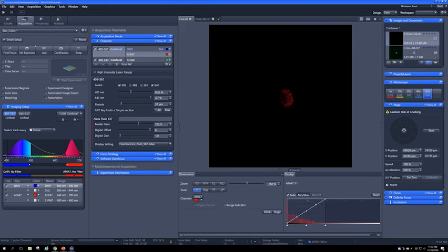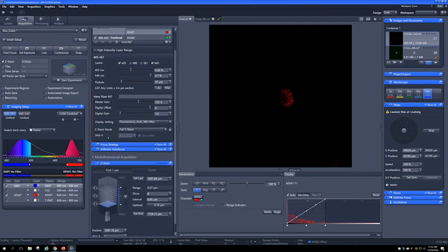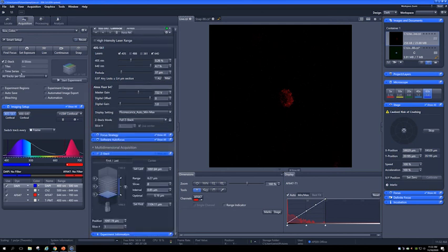To take a Z-Stack, check the Z-Stack box on the top left corner, which will open a Z-Stack tab. While in live mode, scroll to the top of your sample with the focus knob and press Set First. Next, scroll to the other end of your sample and select Set Last. Specify the thickness of slices by either selecting Optimal for the optimal number of sections, or specify the size of the interval to either increase or decrease the number of sections.